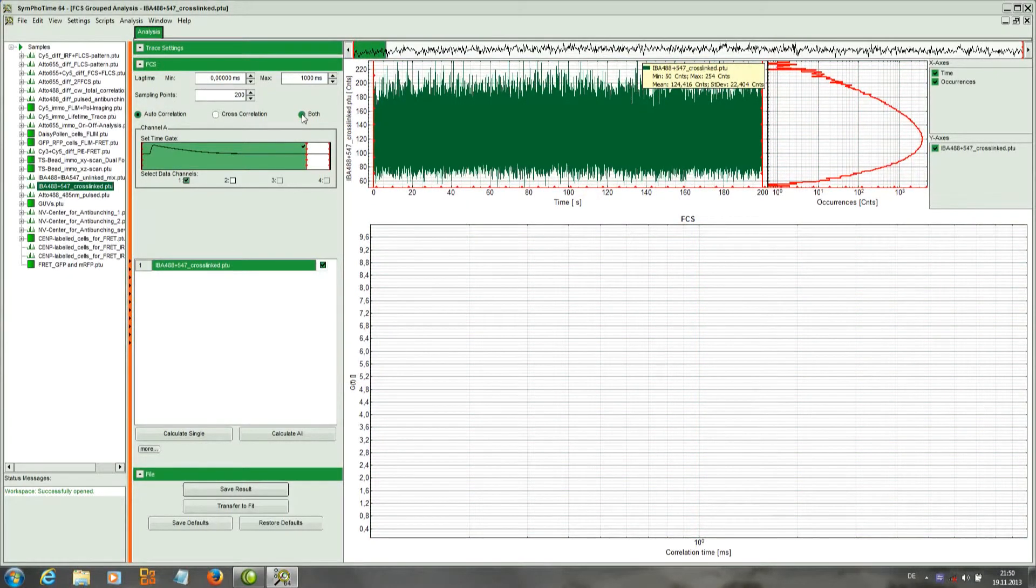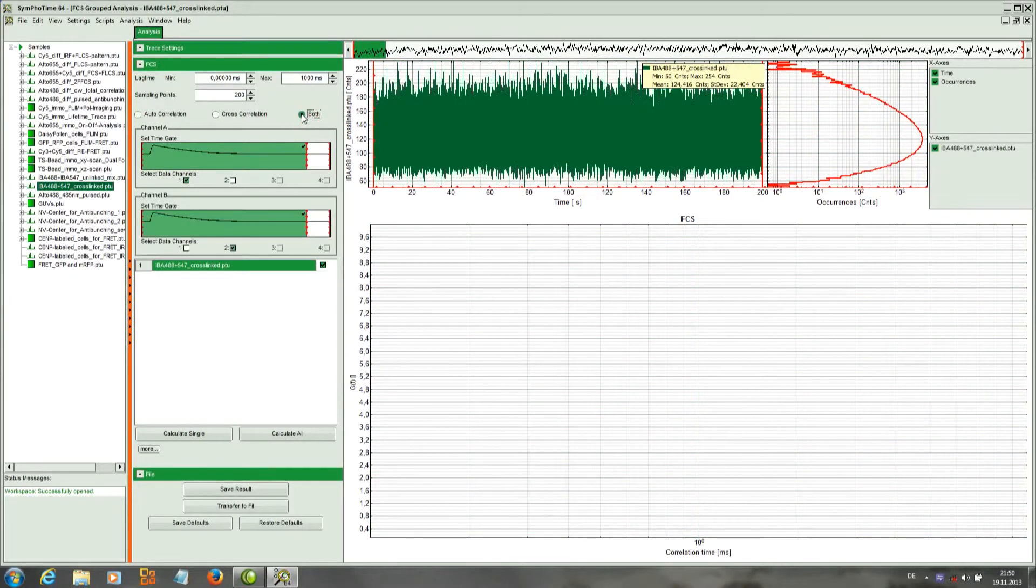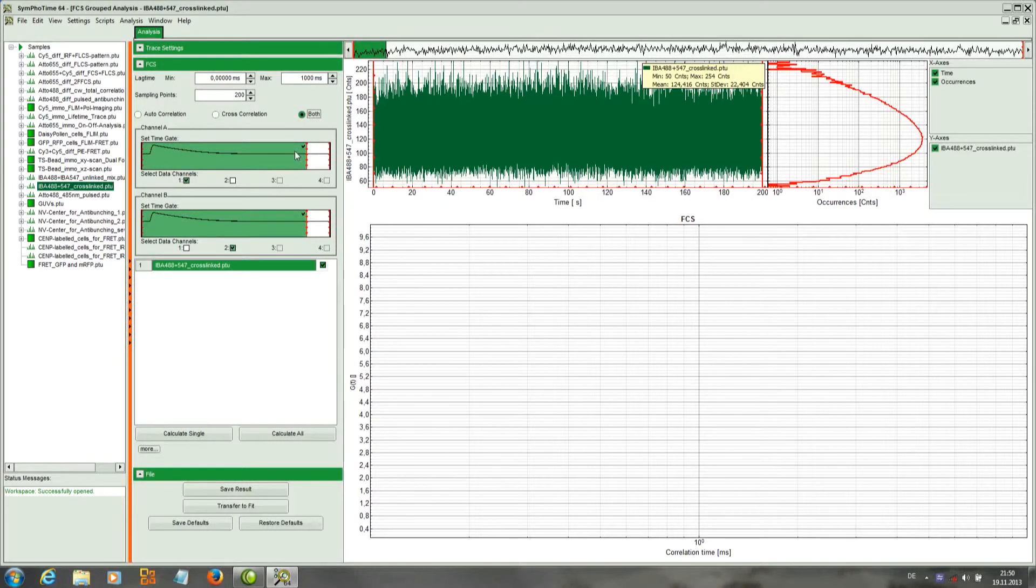We want to calculate auto and cross correlation, so both. Here we have the channel selection and we can additionally adapt a time gate.